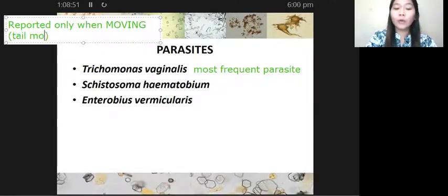We are looking at the tail movements of your parasites. Okay? Ma'am, bakit kailangan gumagalaw?